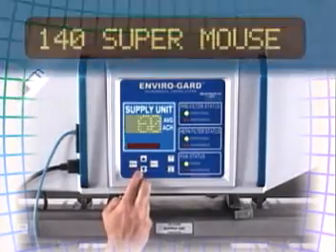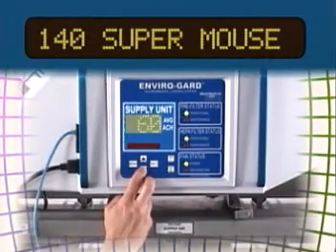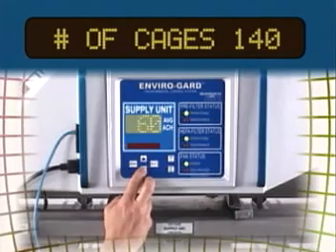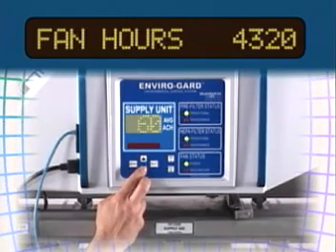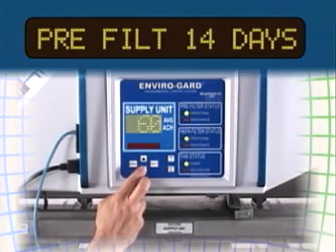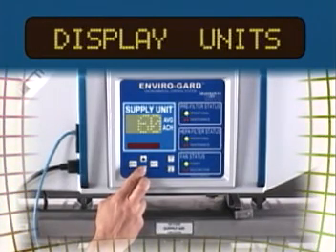A liquid crystal display with scrolling menu presents the status of various operational parameters including fan performance, fan hours, pre-filter condition, room temperature, and more, all at a glance.